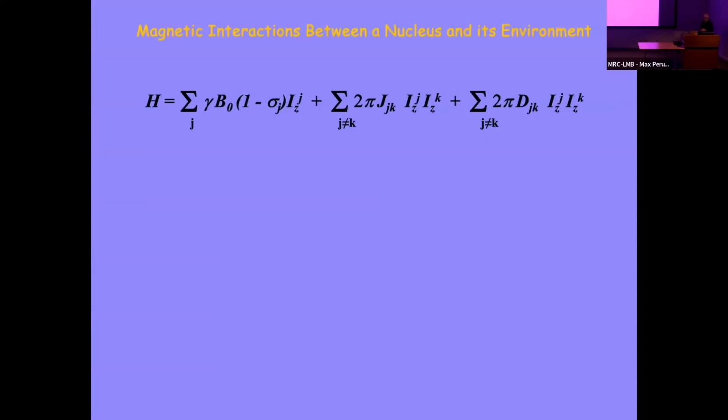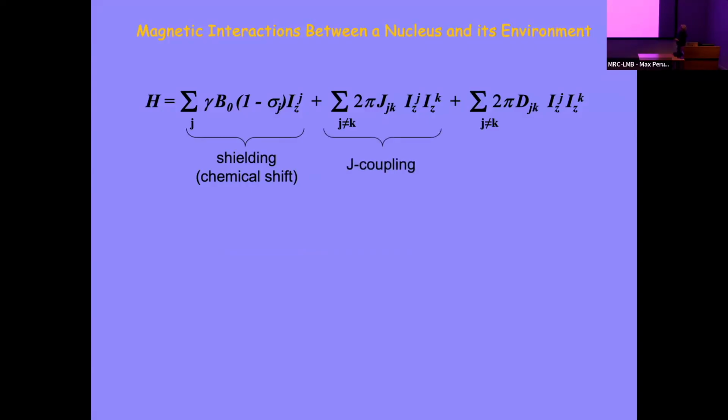I will pass very briefly over this. The idea here is not to show how complicated NMR is, it's to show how easy it is. It's showing the nuclear spin Hamiltonian for the spin angular momentum of an atomic nucleus when you put it into a magnetic field. And it's not the complexity of the expression, it's the fact that it breaks down into the sum of three simple terms that we're focusing on. The first term here is referred to as shielding. The second term is J coupling, and the third is dipolar coupling.